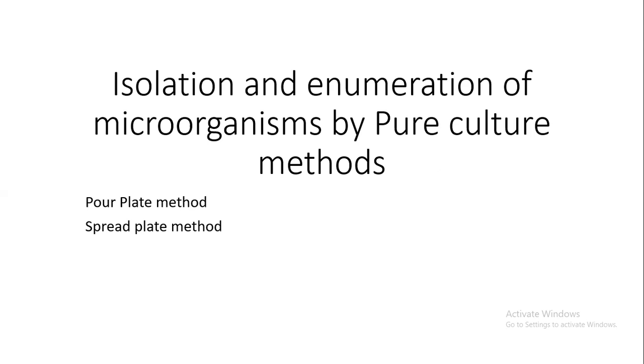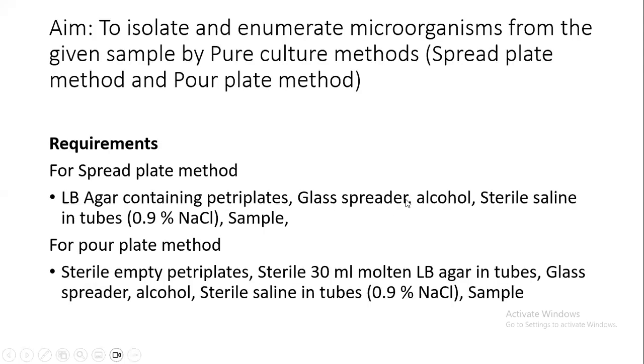Hello students, in today's class we are going to learn about isolation and enumeration of microorganisms by pure culture methods. Here we are going to discuss two pure culture methods, the pour plate and spread plate method. The aim of the experiment is to isolate and enumerate microorganisms from the given sample by pure culture method.